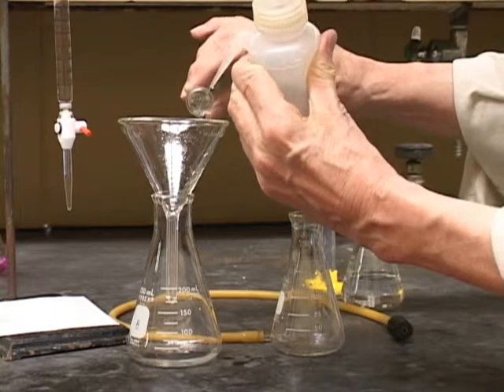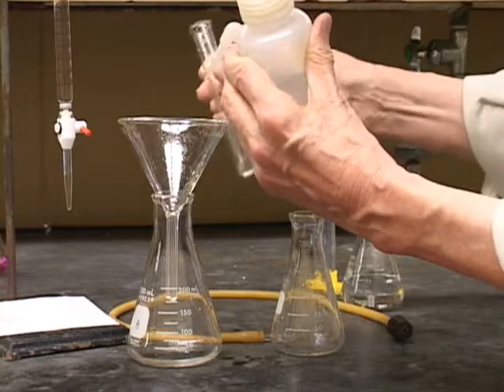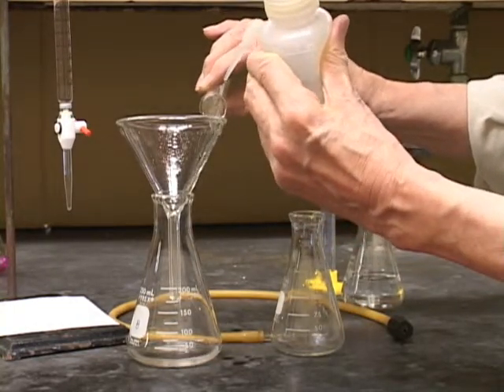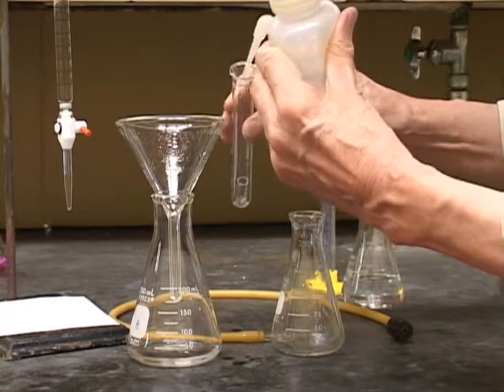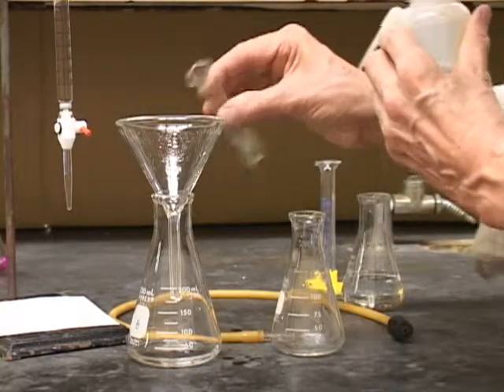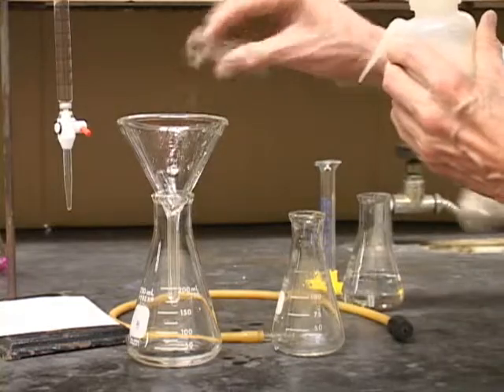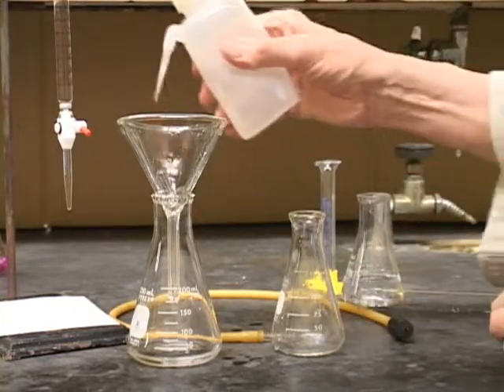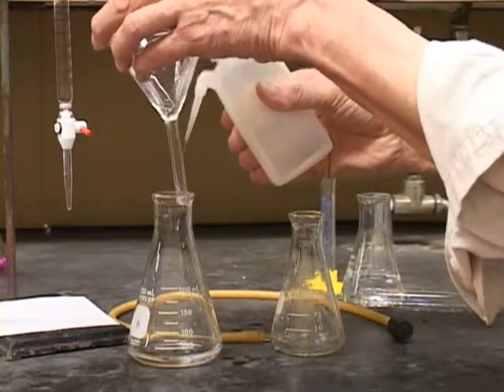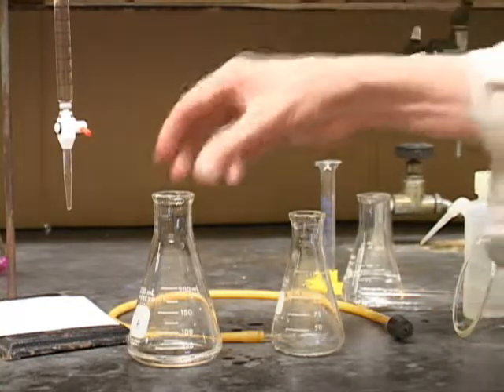Before you raise the reaction tube, rinse off the lips so you don't lose any HCl. Now we are all set to titrate.